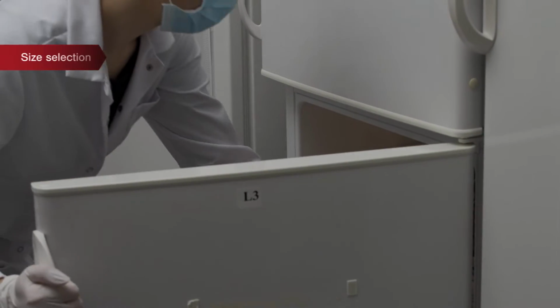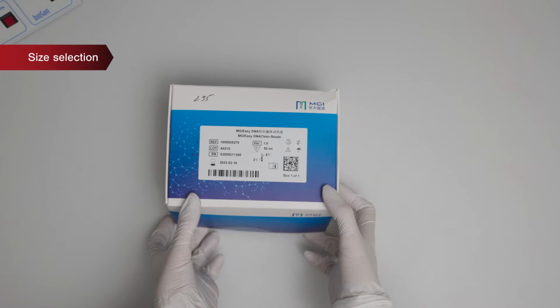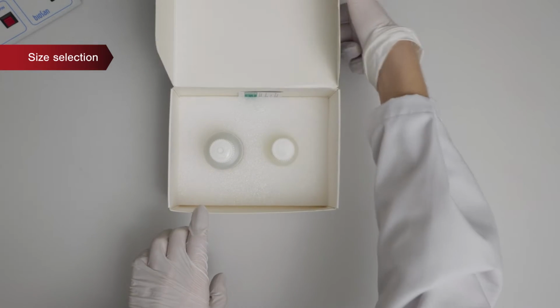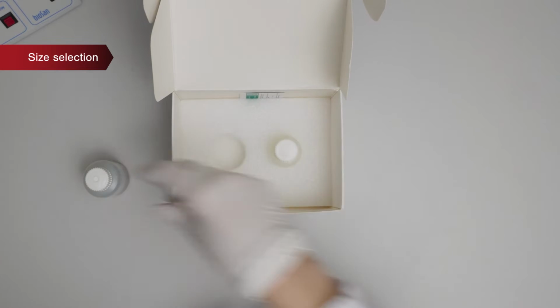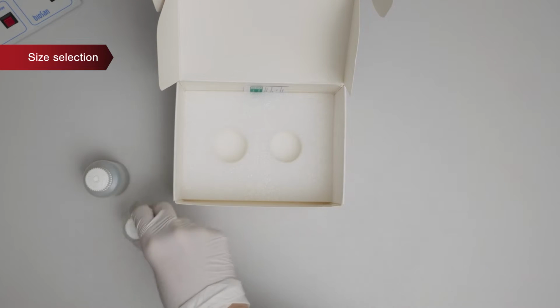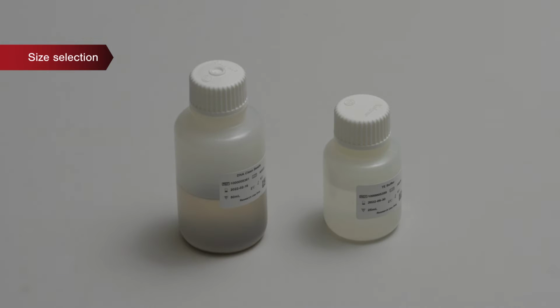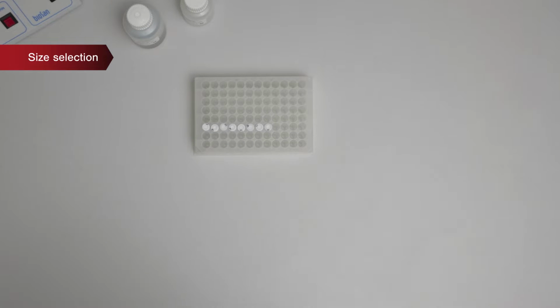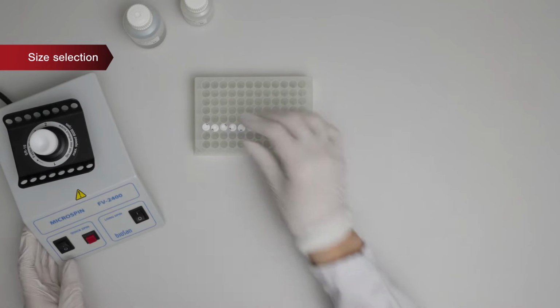After the fragmentation is done, there is still a high quantity of fragments that do not fall in the target range and will interfere with the sequencing chemistry. Therefore, it is necessary to get rid of these fragments by performing size selection. Size selection is required to produce a uniform distribution of fragments around an average size. It is done by using magnetic beads. Alternatively, separation with gel can also be used.